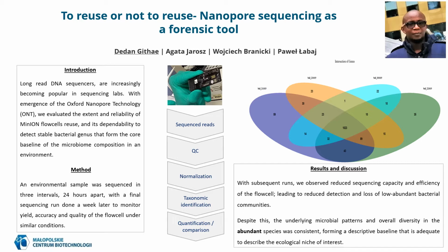With the advent of long-read sequencing platforms such as PacBio and Oxford Nanopore sequencing technologies, they are quickly becoming popular due to their relatively low associated cost of sequencing. In addition, long reads help overcome challenges encountered from the short-read, high-throughput sequencing approach, for example, resolving incomplete assemblies due to complex genomic regions.